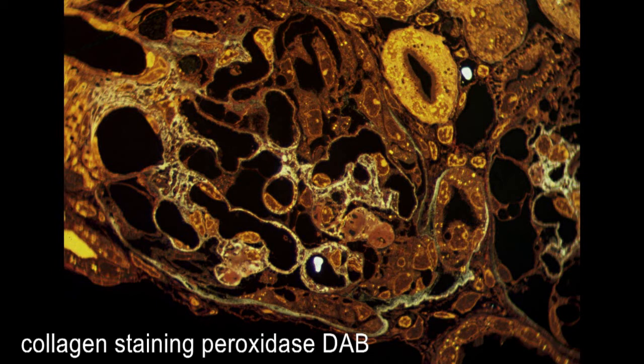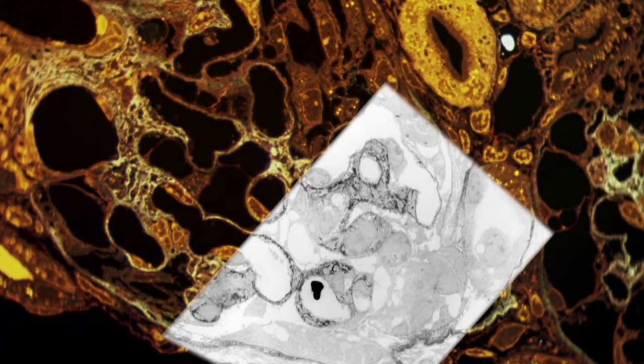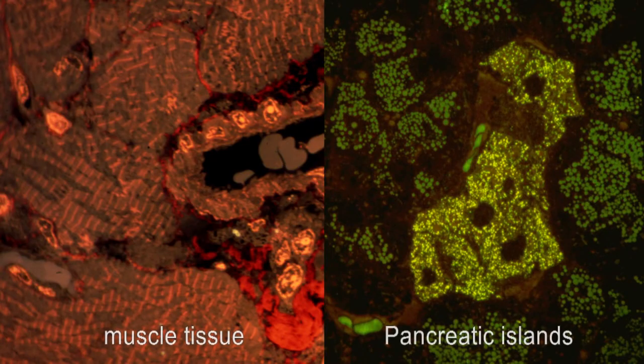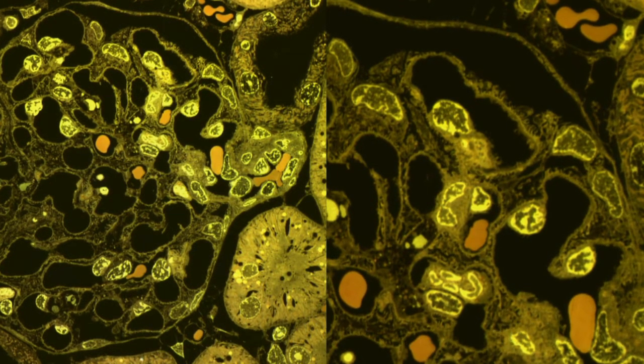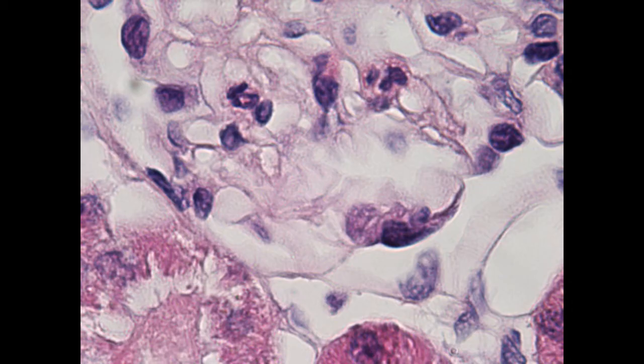A special feature of RCM technology is the use of 50 to 100 nanometer sequential ultra-thin sections, which allows us to use the RCM image as a localization tool for EM. All types of specimen prepared for EM can also be used for RCM. The main difference between RCM and EM is that a glass slide is used for RCM and a copper grid for EM. Only plastic embedded or ultra-cryo sections and whole cell preparations are suitable for RCM. Generally, the normal 4 micron sections are too thick for RCM and result in blurred images.